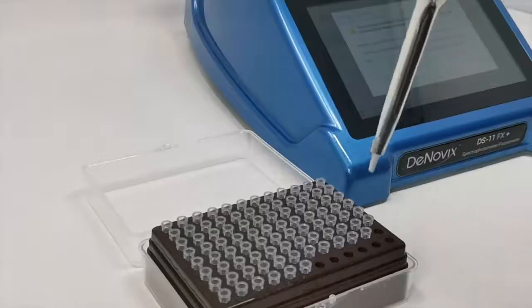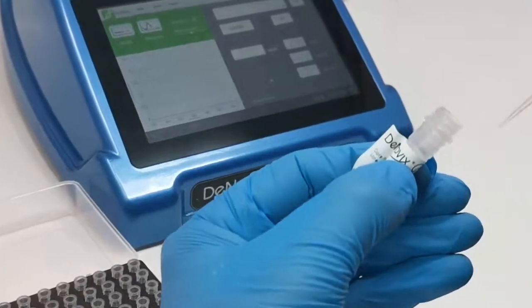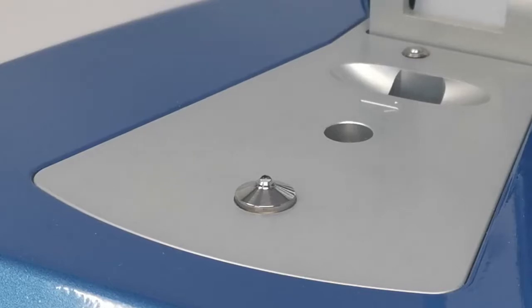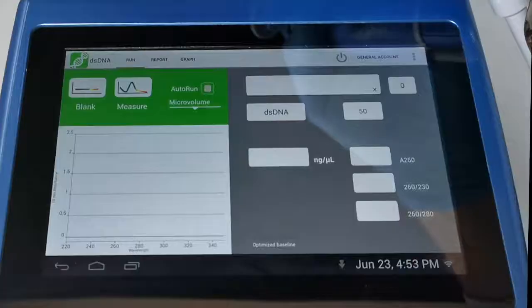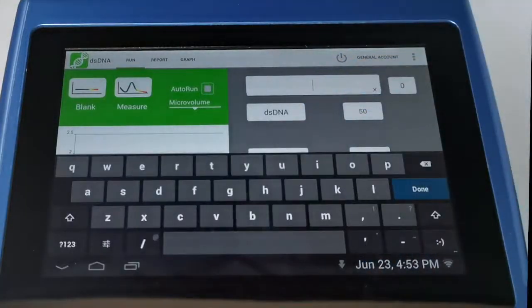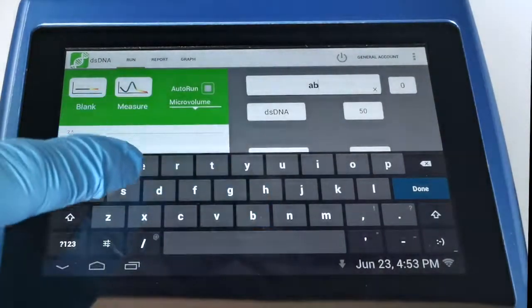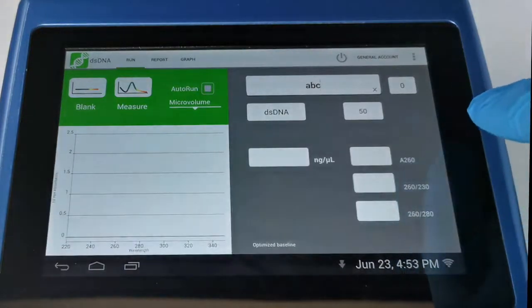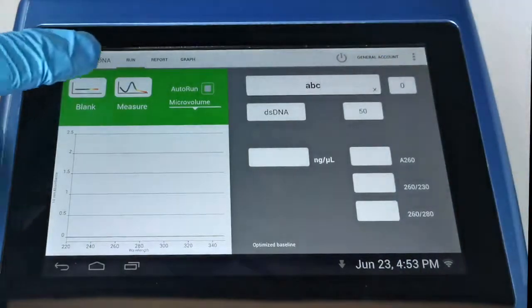So as soon as we've made our blank measurement, we're ready for our first sample. So we take a 1 microliter aliquot and pipette it onto the lower measurement surface and just move the arm down. So at this stage we have the option to enter a sample name, either using the keypad, or we can scan in a barcode, or we can leave this until after we've run our samples and enter the sample names later. We can also select from the user accounts that we've set up, and then we just hit measure.